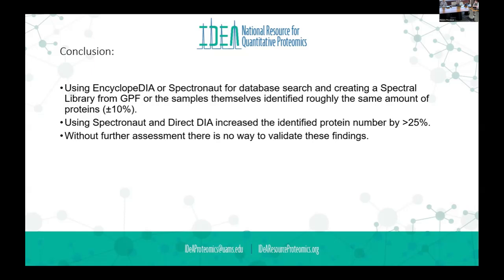It becomes kind of my standard. If there's a protein that I run every algorithm at and it's still different, then that's an important one. If it drops off just because I changed the normalization method, then I'm probably not going to spend a lot of time in the lab looking at it. That's where I draw the line for the biologists who are trying to look at it.